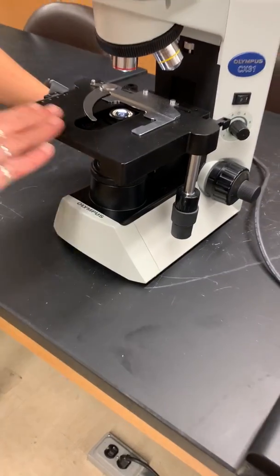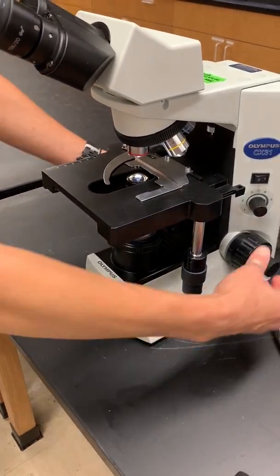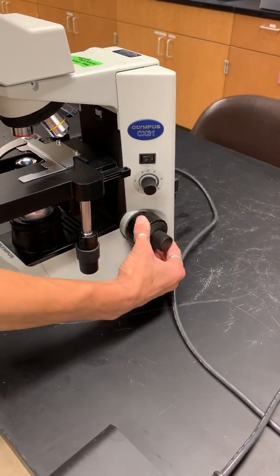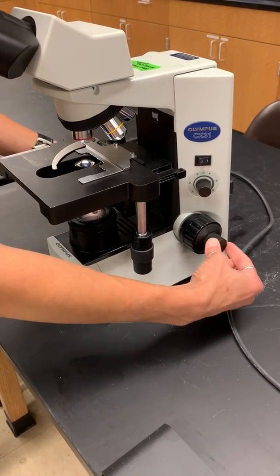The stage — this flat thing where we're going to put the slide — is going to move up and down with these big knobs. These big knobs are what we call the coarse focus, and then the little knobs are called the fine focus.